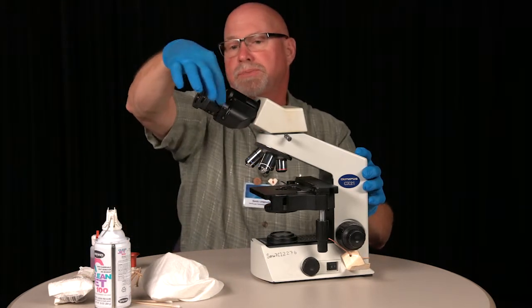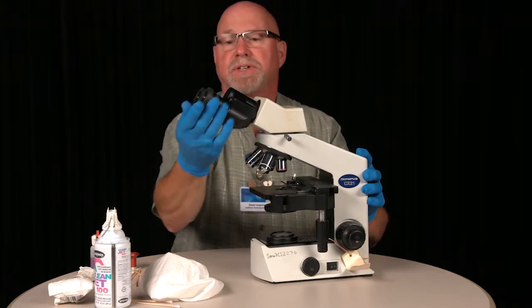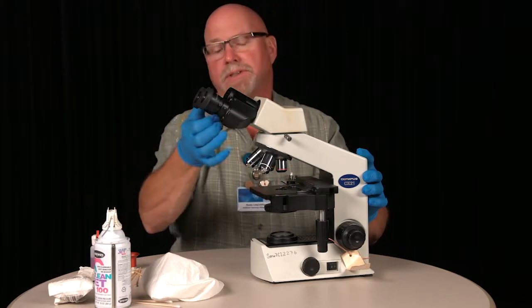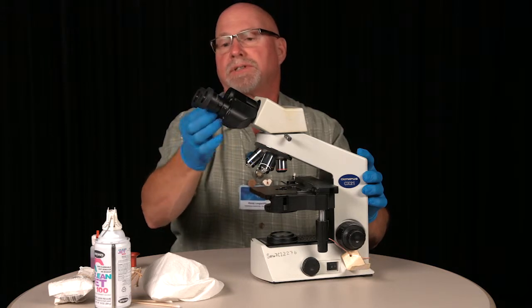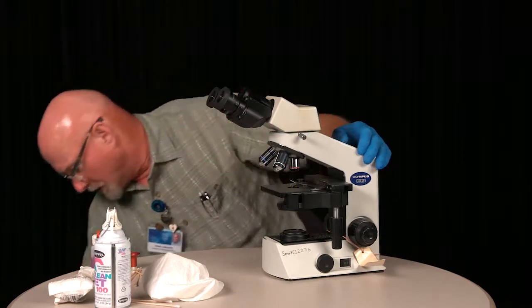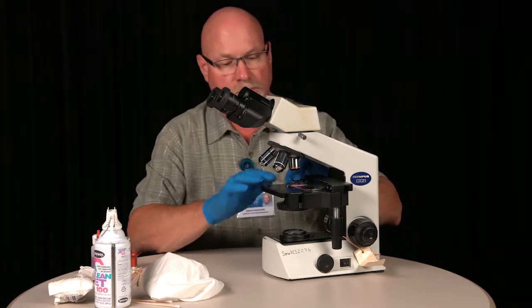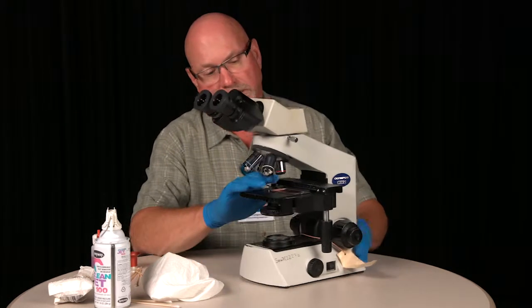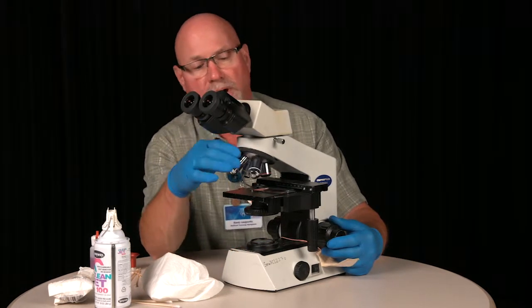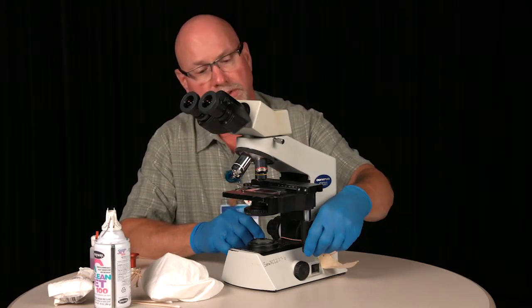This eyepiece tube is fixed, so if you're right eye dominant, you focus on your slide with this eyepiece and then you adjust the left to match. From this point, you'd put your slide on the stage, swing in either your low power or 10 power, and focus on your specimen.